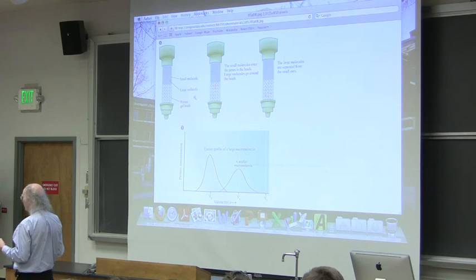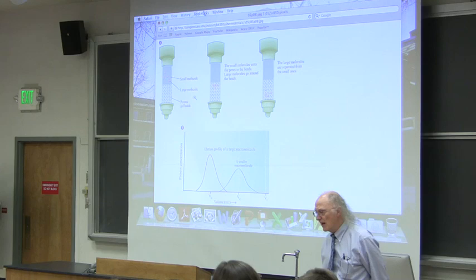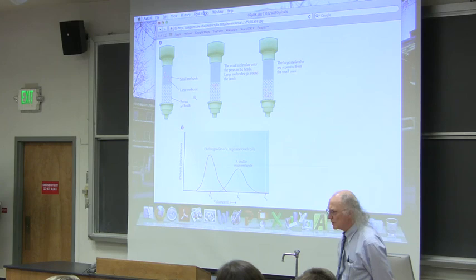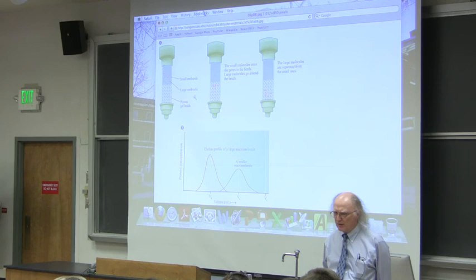How many different sizes would you usually be able to separate out? Yeah, that's a good question. It's a fairly crude method. So you would probably do it something like what I said, something under 50,000 compared to everything over 50,000. There's some things in the middle, but for the most part, it's a fairly rough way of going at it.